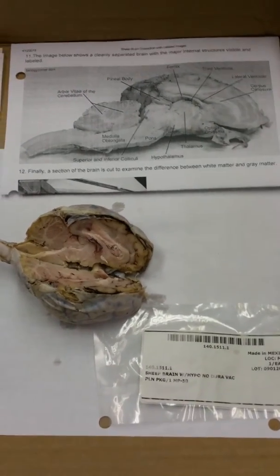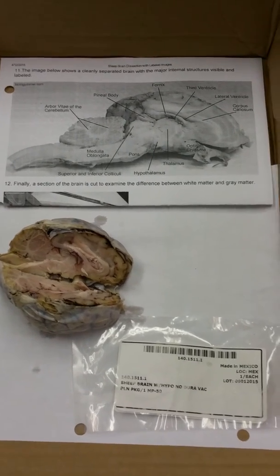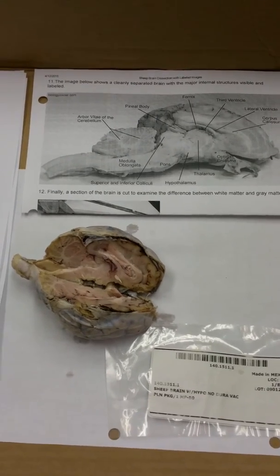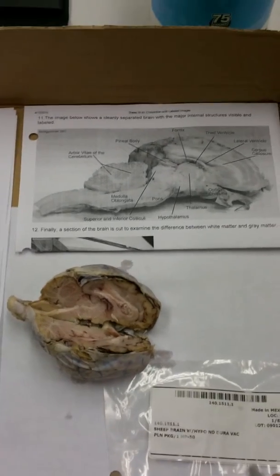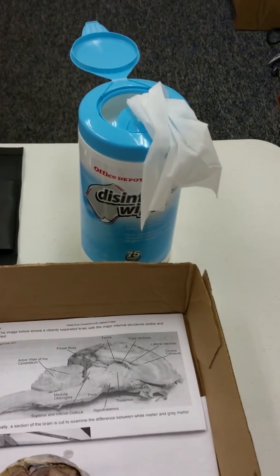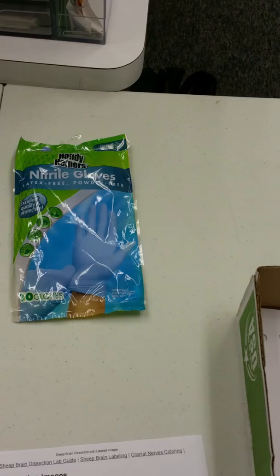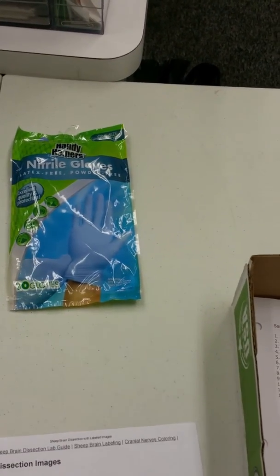So this will be wrapping up my dissection of the sheep brain. As you can see from the packaging, this is the brain, and we're able to dissect the brain and use it as a good point of reference, and then also use the pictures. Now the final step, like anything else, is we're going to go ahead and disinfect. We're going to go ahead and put away our tools. We're going to go ahead and change our gloves when we're cleaning the desk to create a clean surface, and then wrap up the project.